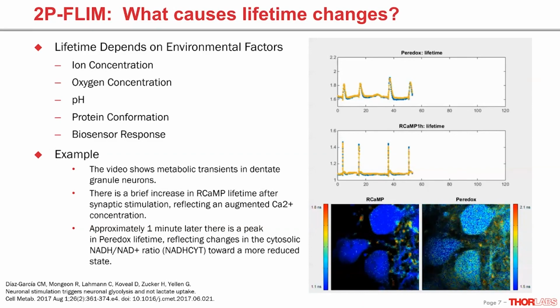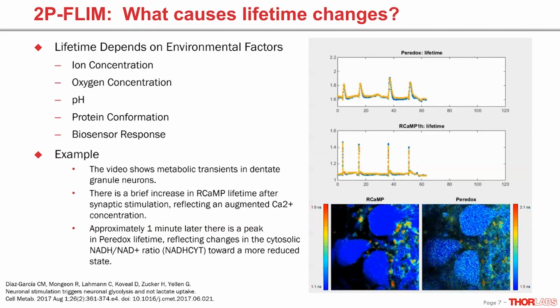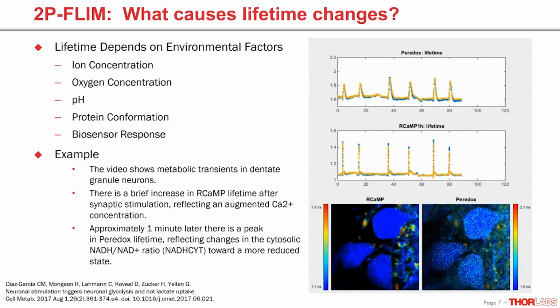the change in calcium. For reference, the images are pseudocolored according to the sensor lifetimes, which is shown on the scale bars on the sides. Furthermore, we can calibrate this to show the ratio between NAD and NADH at any given point in time.